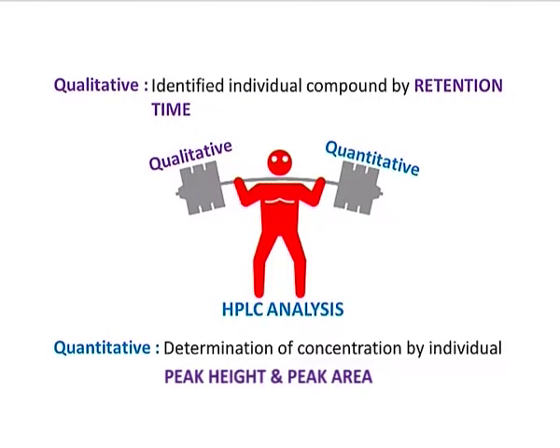With quantitative analysis, it means in a given sample, we would be able to determine or approximate the concentration of an individual component using HPLC, using a typical chromatograph, and that can be done once you know the peak height and you calculate peak area accordingly.